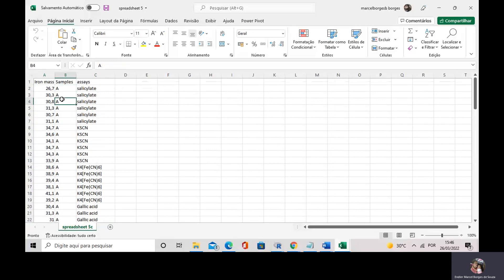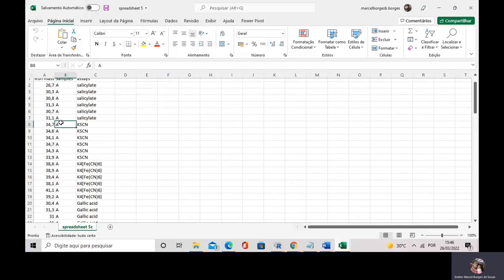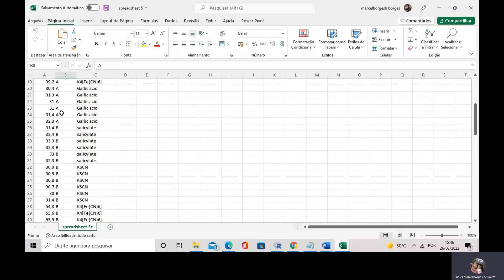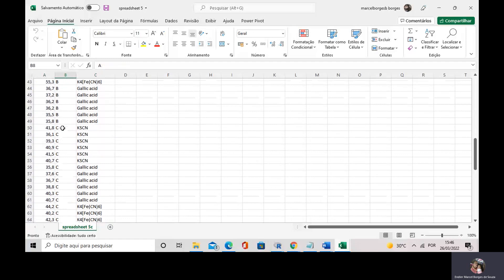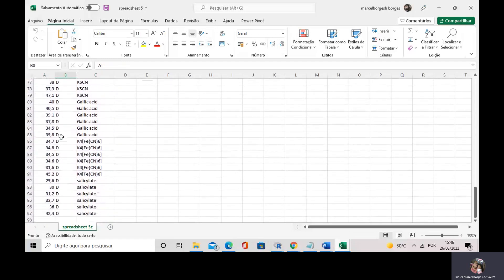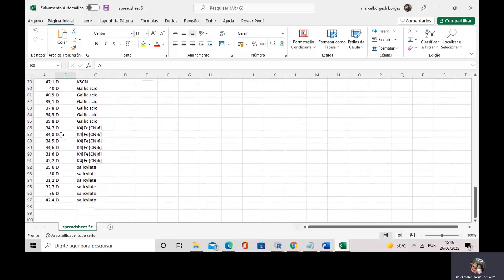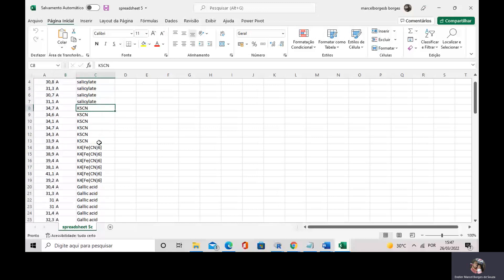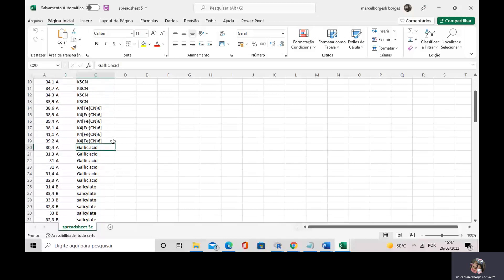Here I have the iron supplement A, I have the iron supplement B, the iron supplement C, and the iron supplement D. I chose iron supplements where I analyze with four independent assays. I have used the salicylate assay, the thiocyanate assay, the prussian blue assay, and the gallic acid assay.